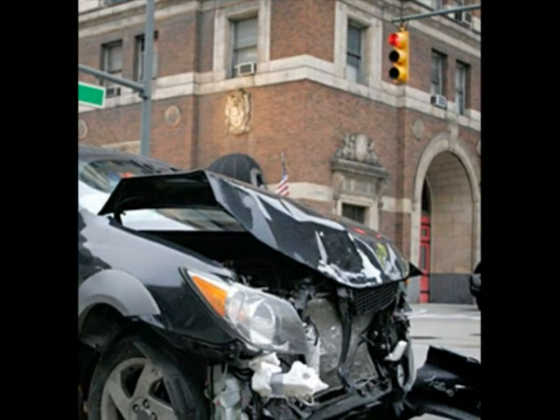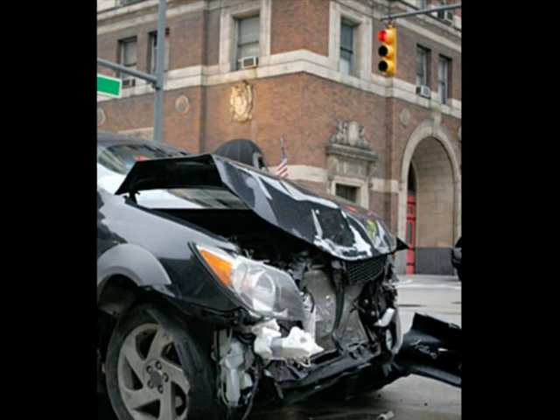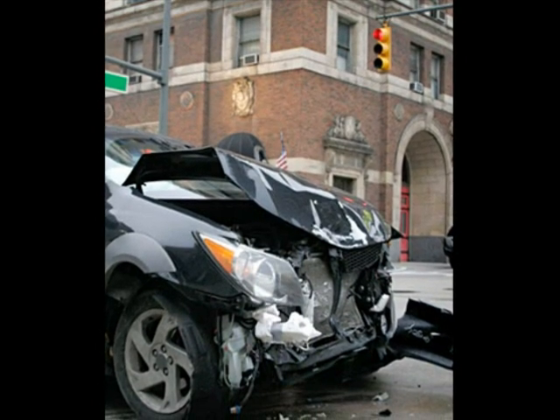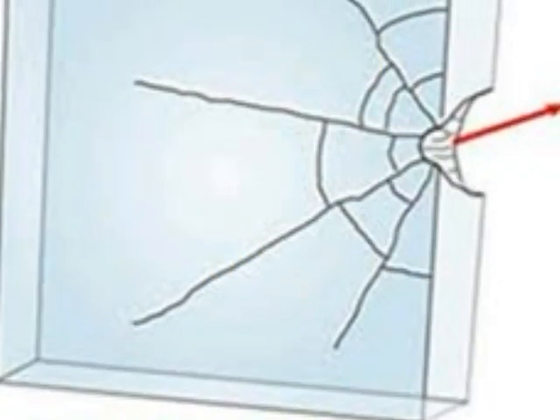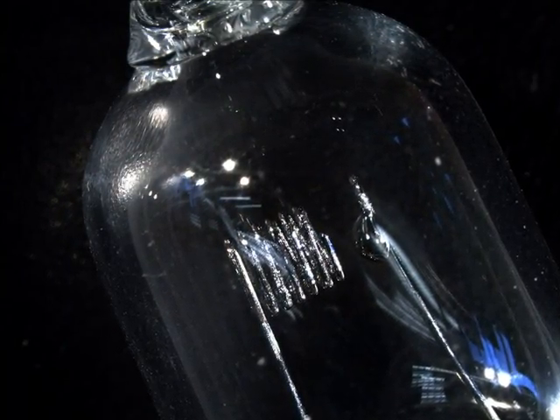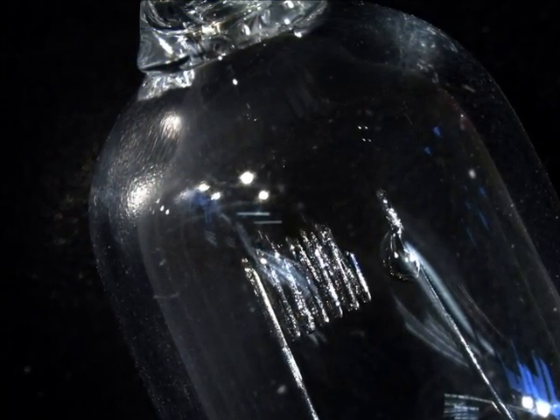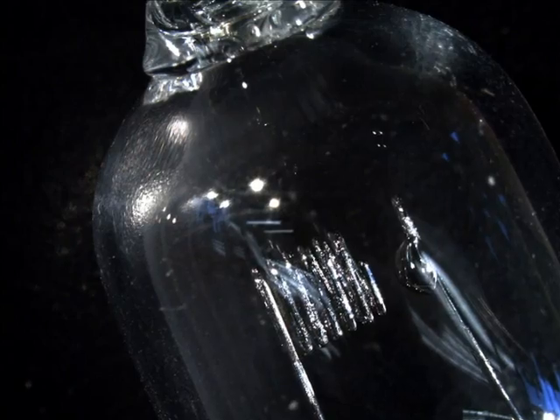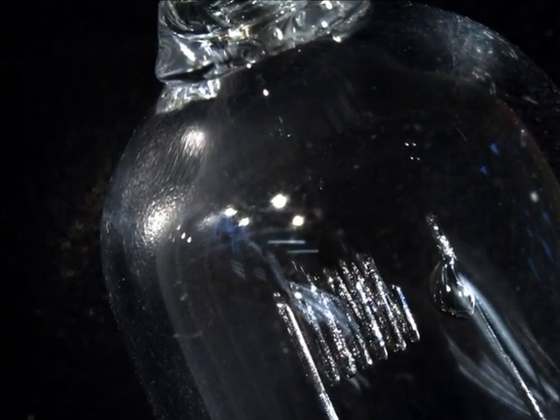To put these components to use, several forensic applications can use the stereomicroscope to its advantage. These applications include forensic engineering, fractography, and trace examination. Forensic engineering is applied when a person is harmed or there is damage to someone's possessions due to the failure of a material to operate properly. An example of applying stereomicroscopes in forensic examination is the examination of a failed lamp filament.